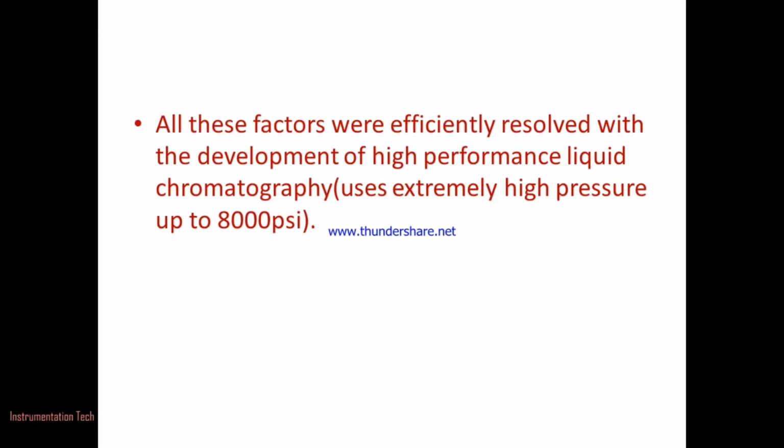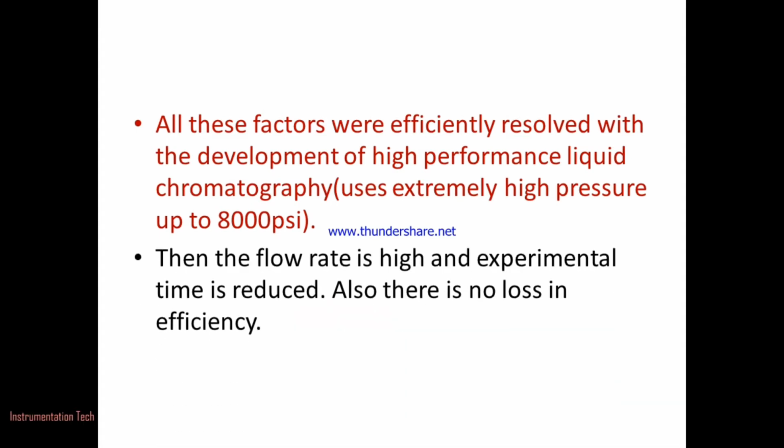All these factors were efficiently resolved with the development of high performance liquid chromatography. This method uses an extremely high pressure, up to 8000 psi. It is equivalent to 550 bar. The flow rate is high and the experimental time is shortened considerably.